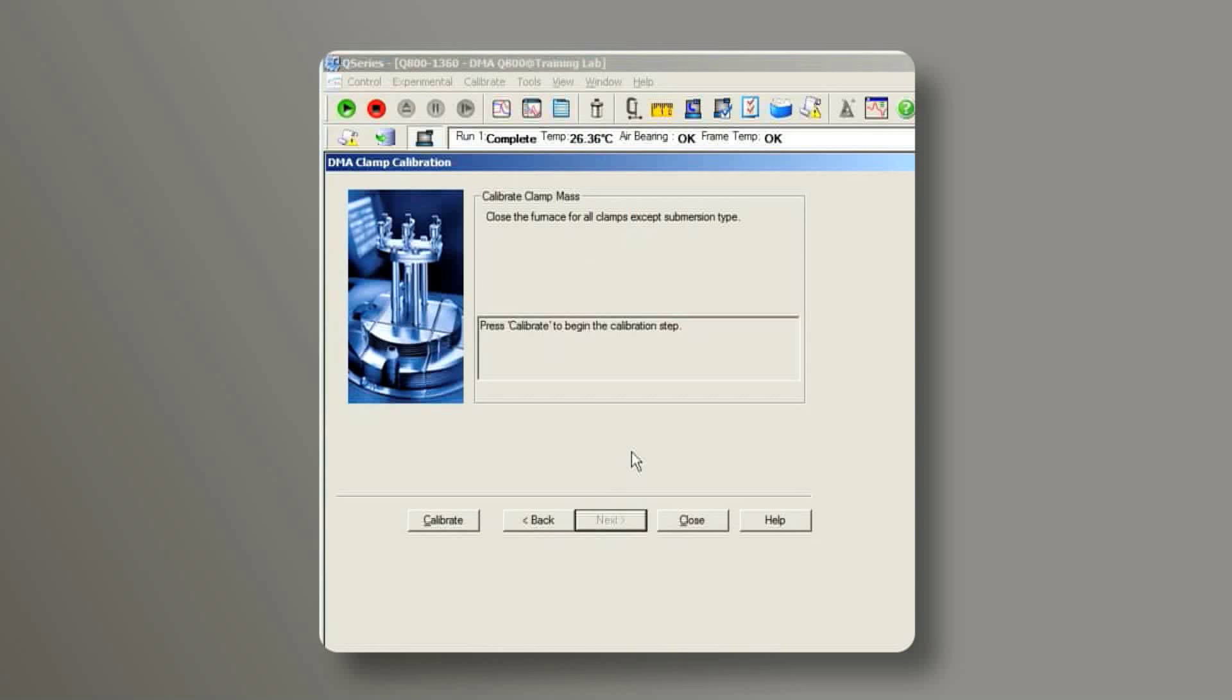Close the furnace from the instrument touch screen, then click on Calibrate. This first calibration step is to calibrate the mass of the movable clamp.